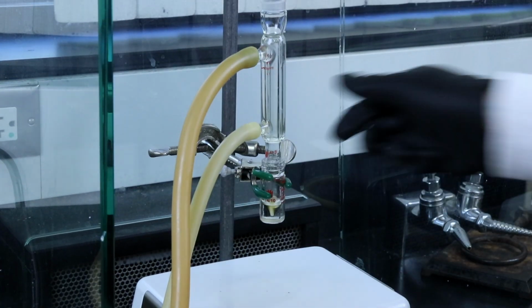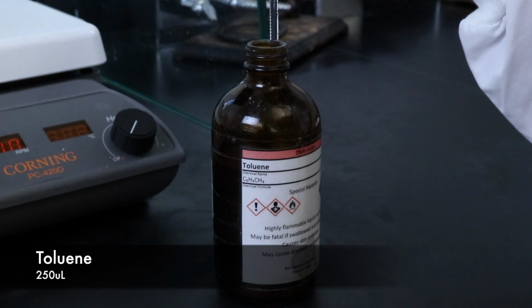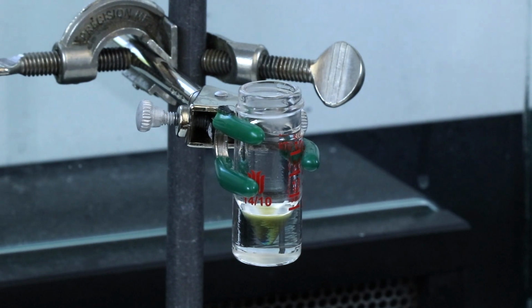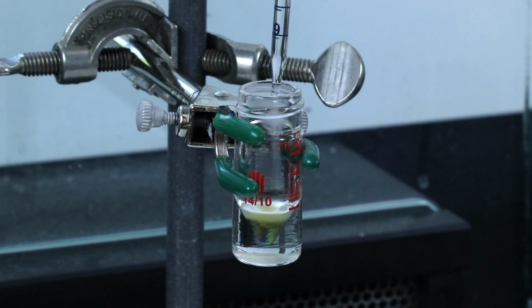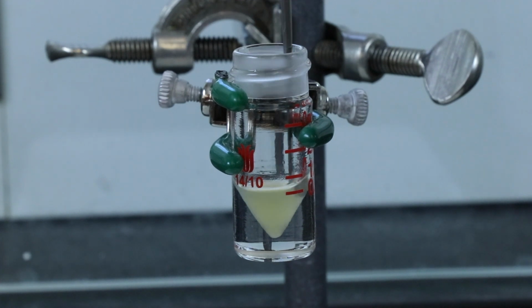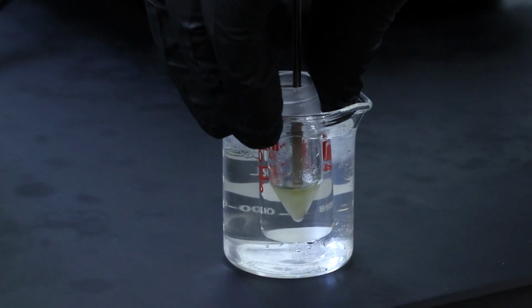After the half hour has passed, I'll move the apparatus off of the heat so things can cool, and I'll be adding 250 microliters of toluene to help the product crystallize out of solution. I'll stir the solution with a spatula and scratch the sides of the glass just to help with this crystallization process. And finally, I'll place it in an ice bath to make sure that all of the crystals did come out of solution.